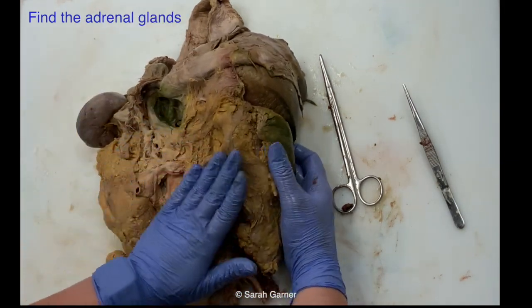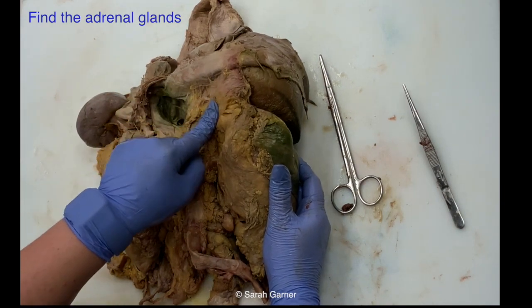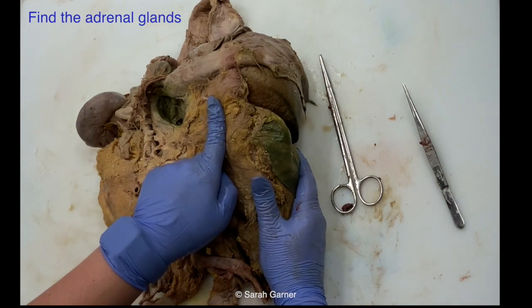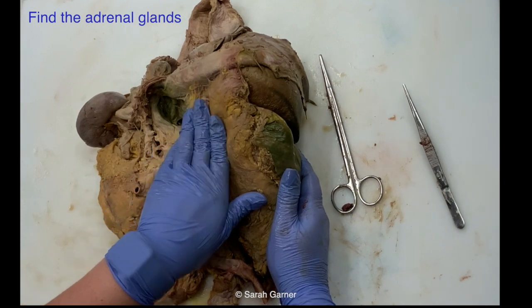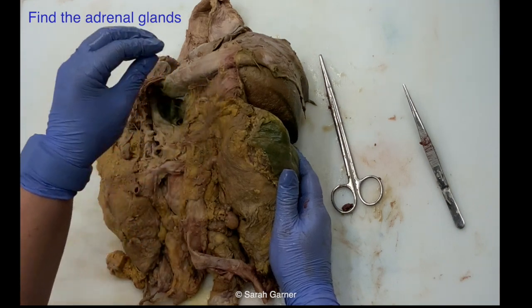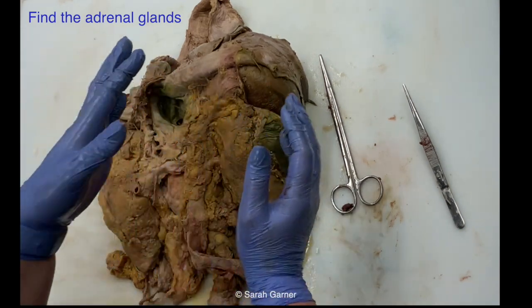And then remember, your adrenal glands are going to sit superior to the kidneys, but also a little bit medial. So I can feel it right here. Again, this is another great example of why feeling is so important for pathology. Fat and adrenal glands can look eerily similar. If you're not palpating carefully and trying to feel for that adrenal, you may not be able to find it in the fat, or you may accidentally cut through it, and then that will mess up your weights.